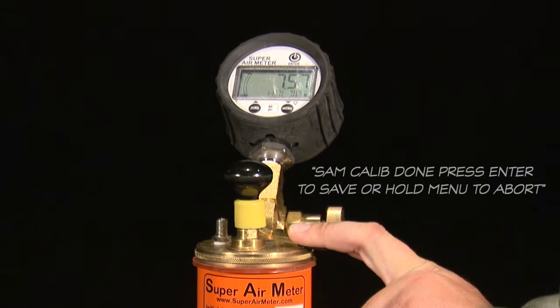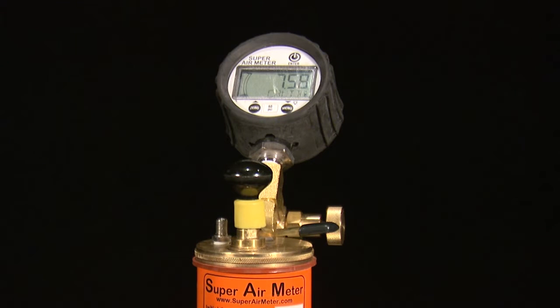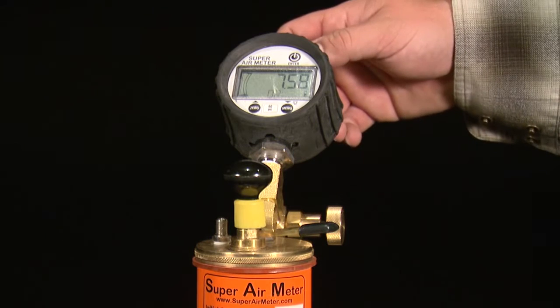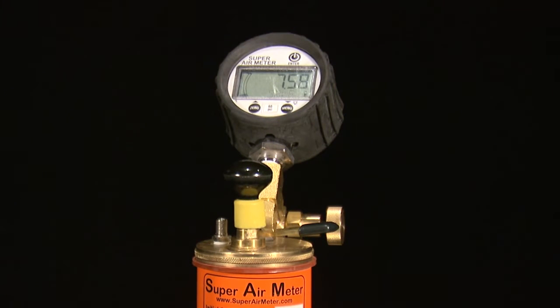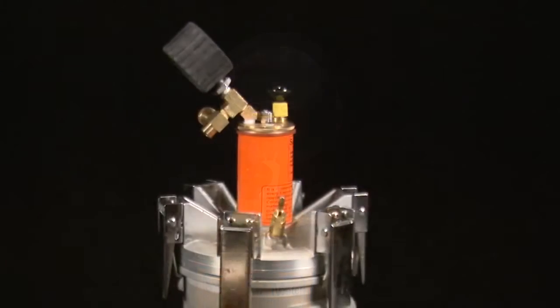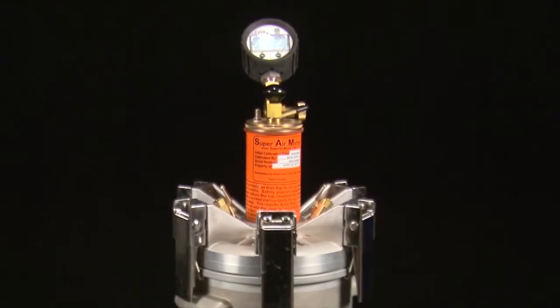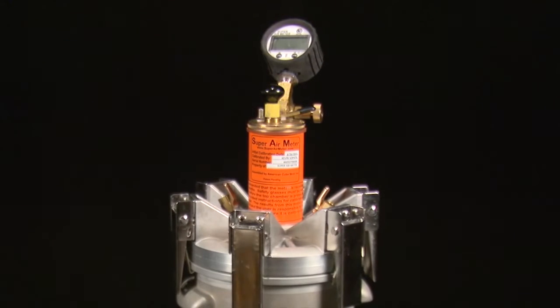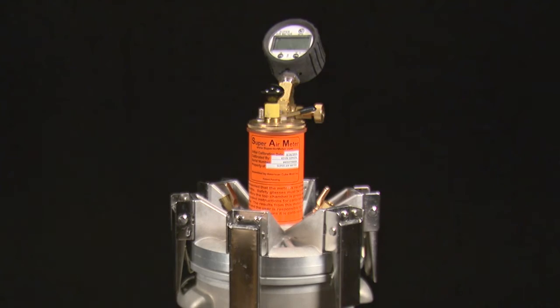The gauge will now display SAM calibration done. Press enter to save or hold menu to abort. If you are sure that you've performed the SAM calibration correctly, press the enter button and it will save the calibration values and turn off the gauge. If you think there has been an error, hold the menu button to abort the calibration without saving and try running the calibration program again. The meter will shut off after you save the values, which is necessary to save into the memory of the gauge.